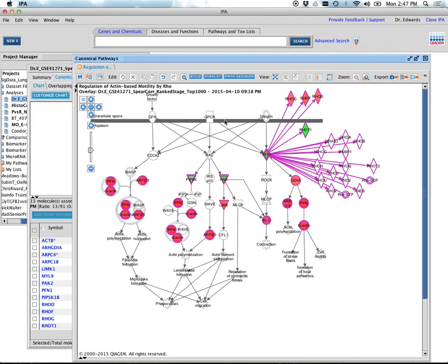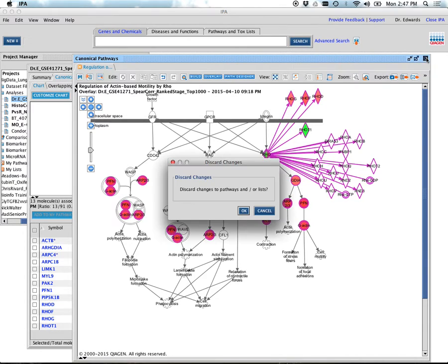It's probably internal. That's one thing to keep in mind when you look at these: remember, we're looking at cancer. If everything was going exactly like it was supposed to, then there wouldn't be cancer, right? That's kind of what you're doing when you're looking through this: how does this lay out and what doesn't make sense? And the things that don't make sense are probably the most interesting to really drill down into.